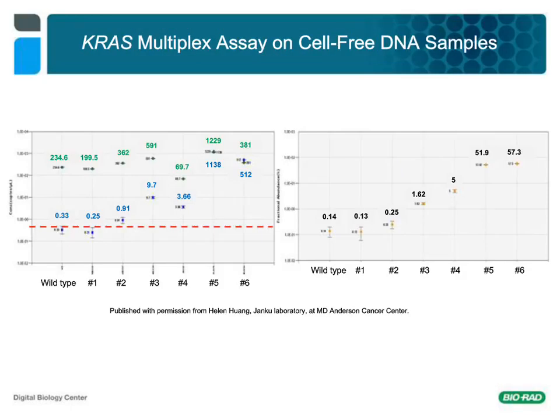These are the concentration plots and a fractional abundance graph, percentage mutant, of wild-type KRAS in green and mutant KRAS in blue, with a percentage mutant in orange from 6 MD Anderson Cancer Center cell-free DNA plasma samples, demonstrating the range of mutant detection in real samples.